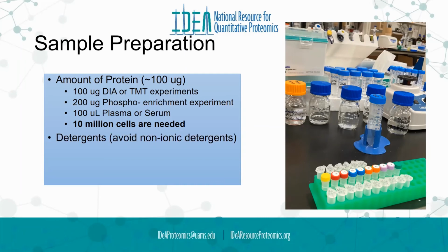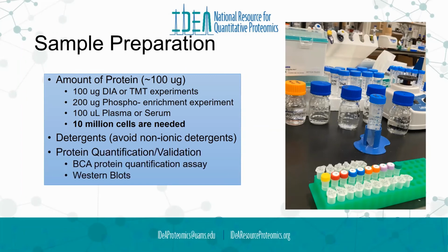It's important that you avoid all non-ionic detergents in your sample preparation. And it is suggested that you do a protein quantification or validation, which might include a BCA assay or a Western blot.